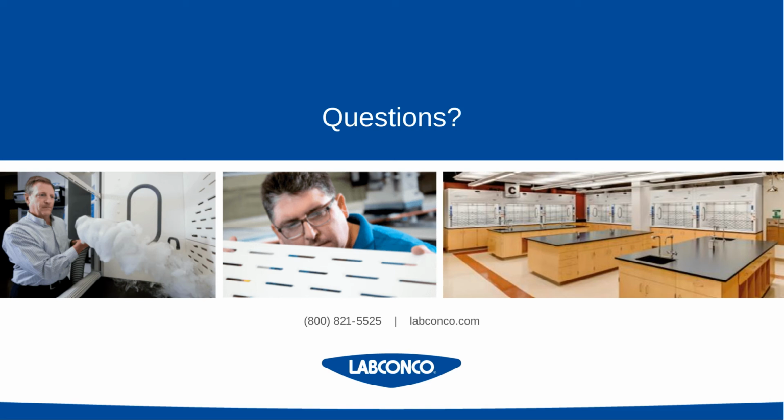Thank you, Kasey, for that answer. So looking at our next question, okay, here's one for you. When replacing an auxiliary air hood with one of these other options, what is the primary concern that should be addressed?